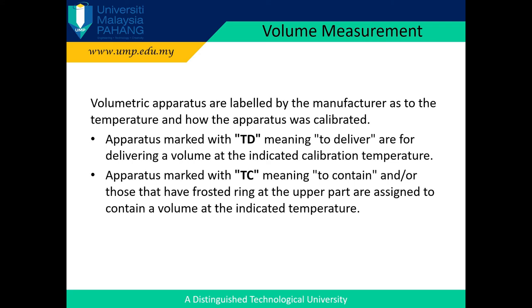Apparatus marked with TC, meaning to contain, and those that have a frosted ring at the upper part, are assigned to contain a volume at the indicated temperature.